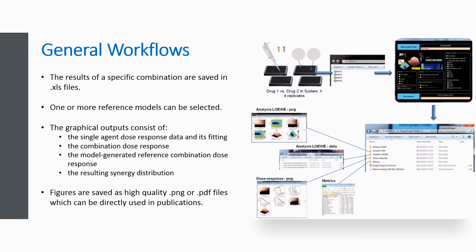A typical analysis is performed as follows. First, upon completion of experiments, the results of a specific combination, including replicates if available, are saved in .xls files. Once ComBenefit is launched, the project folder containing all experimental .xls files is selected. Then, one or more reference models can be selected. Other options and graphical outputs can be chosen as per requirements or preferences. The graphical outputs consist of the single-agent dose-response data and its fitting, the combination dose-response, the model-generated reference combination dose-response, and the resulting synergy distribution.